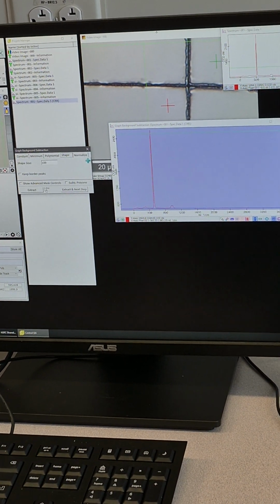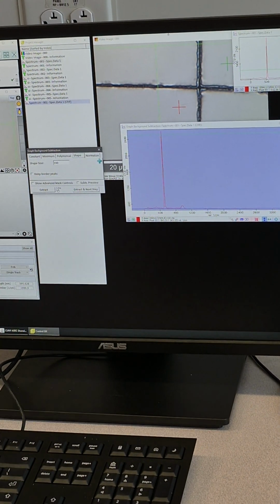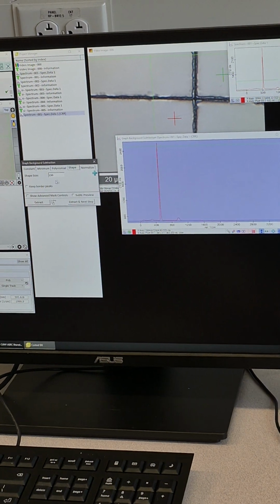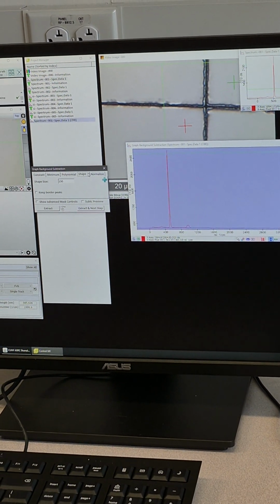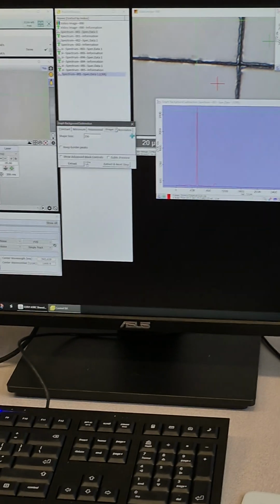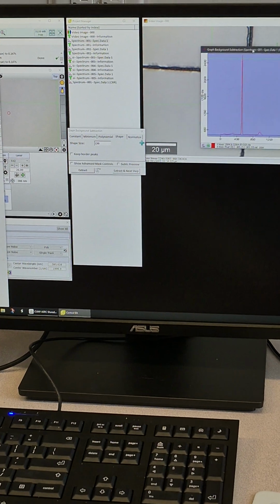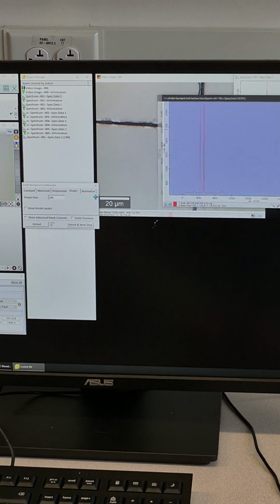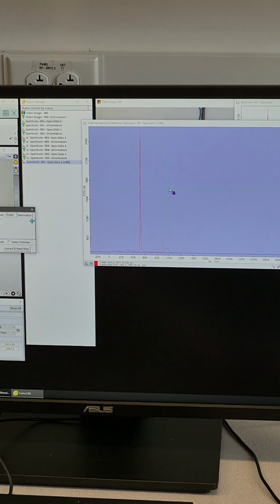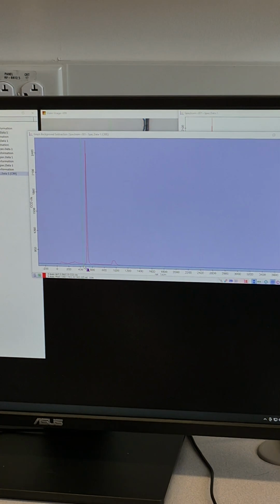For background subtraction, there's a couple of ways to do it with different algorithms. I'm not familiar with the rest of the algorithms; I'm only familiar with the shape. Most of the time people use it to remove the background. In this case, the red one is always the input and the blue one is always the output.